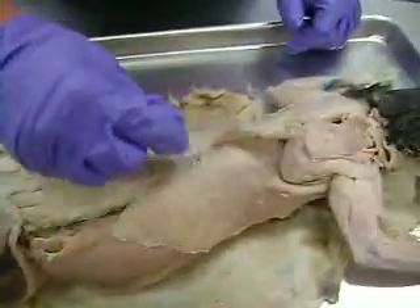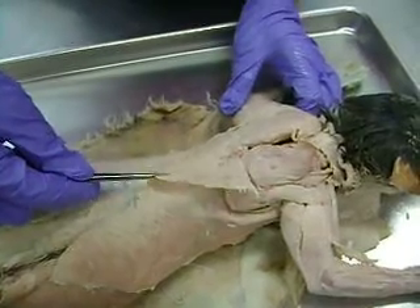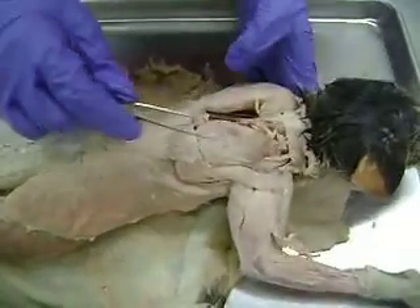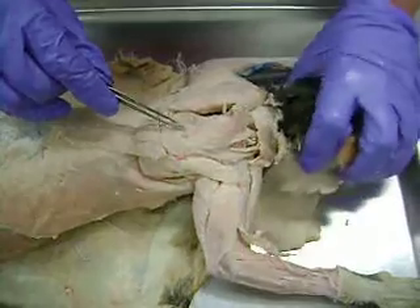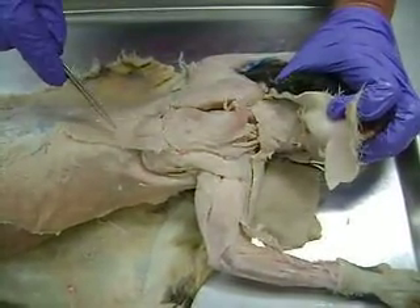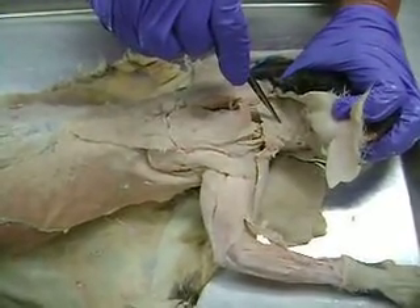This muscle that's sort of triangular that flips over top of the latissimus dorsi is spinotrapezius. And then as you move upwards, this would be acromiotrapezius, and then upwards a little bit more, this would be clavotrapezius. So the three trapezius muscles: spinotrapezius, acromiotrapezius, and clavotrapezius.